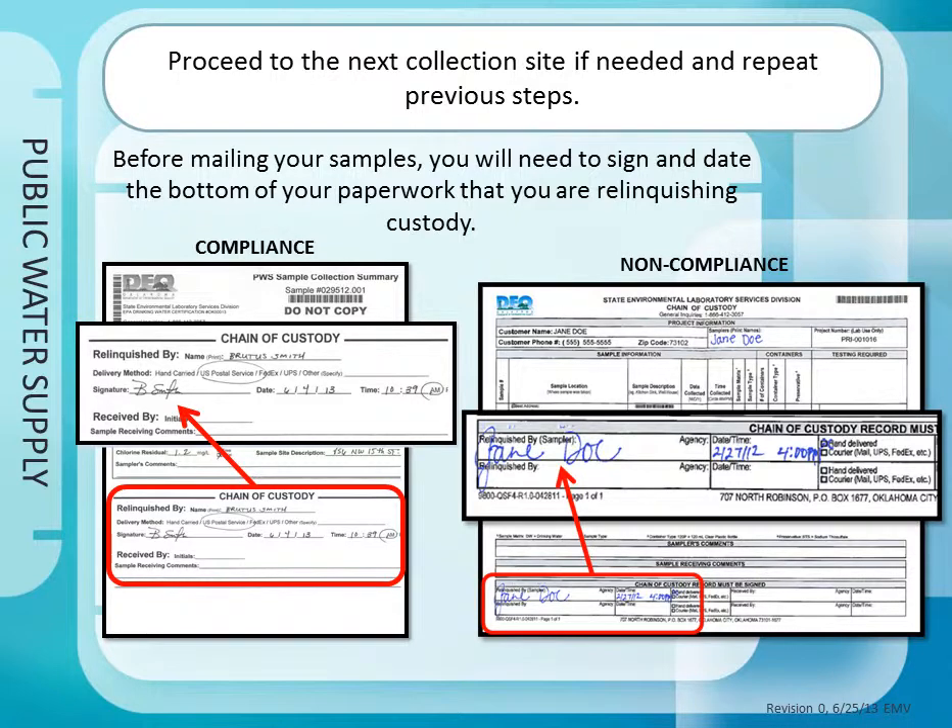If you need to collect additional samples, repeat the previous steps for collection and paperwork. If you are mailing your samples to DEQ, sign and date the bottom of the chain of custody paperwork on the line labeled Relinquished By. If you are hand delivering the samples, the person delivering will sign this at the receiving window of the sample management unit.